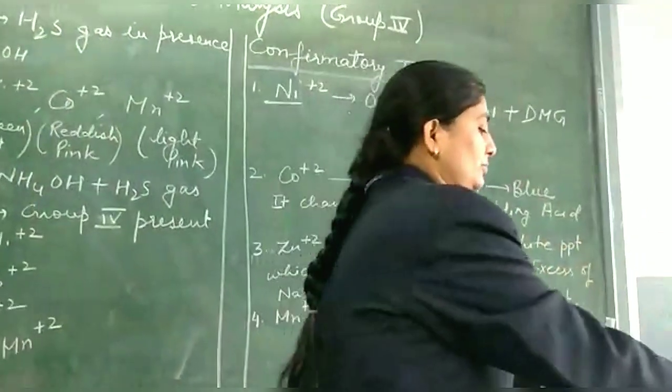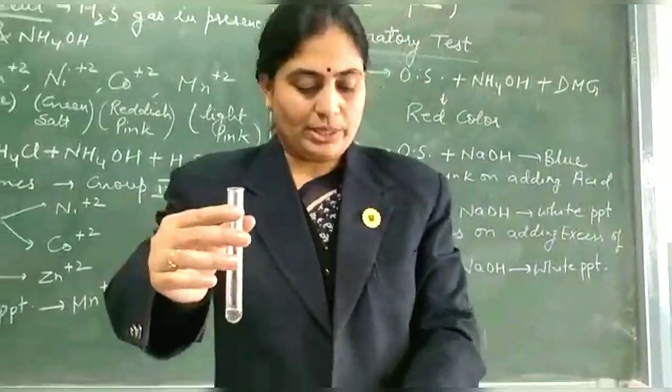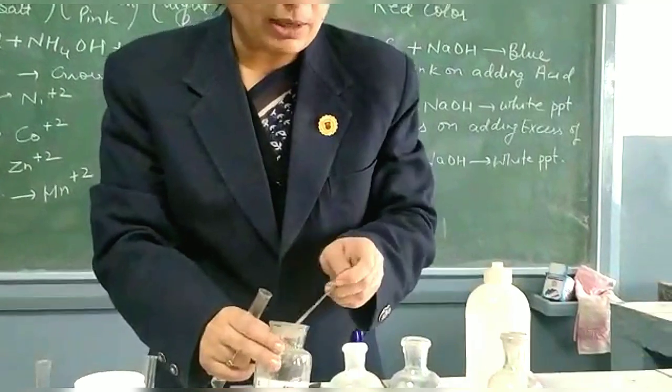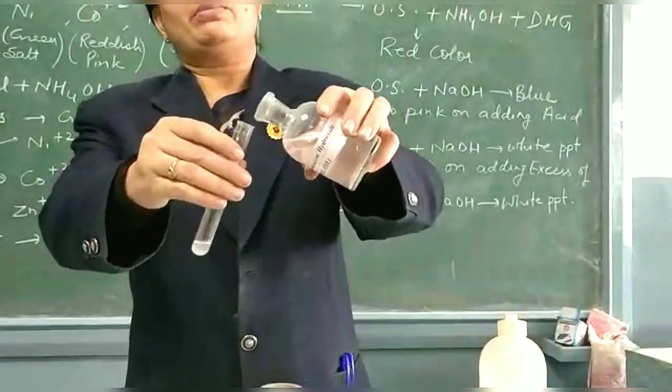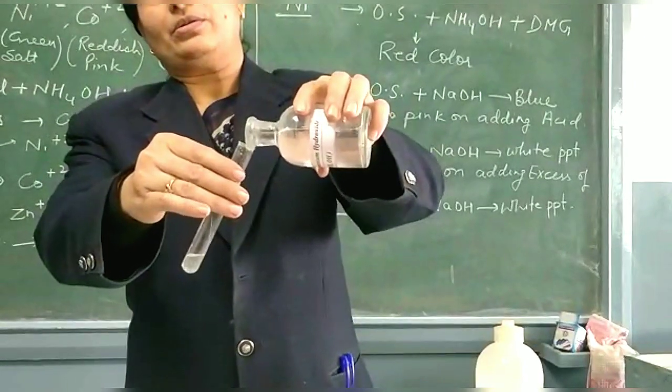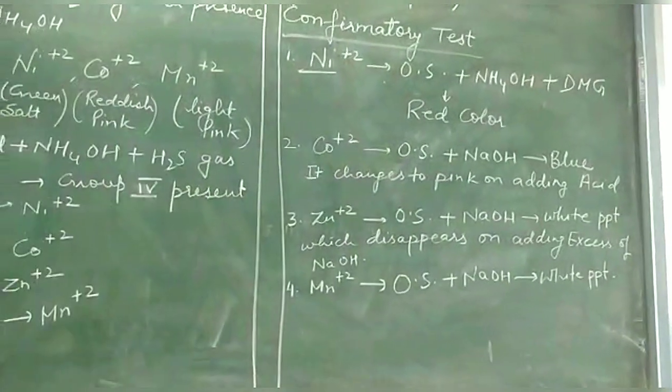Now to this I'll add a small amount of ammonium chloride and ammonium hydroxide, and then I pass H2S gas to it.